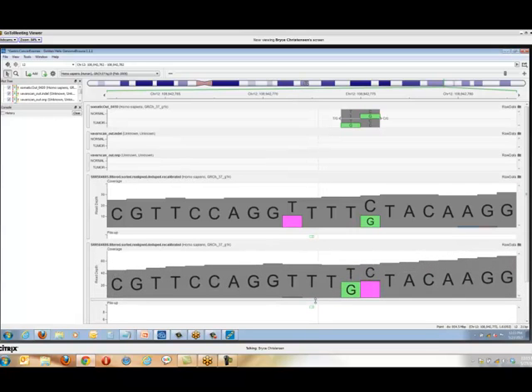And these samples had local indel realignment done using the exact same pipeline, run one after another, but the local alignments did not give the same result. What happens is that in the normal sample, it called a one base deletion at the beginning of this string of T's, and then a C to G SNP at the end.